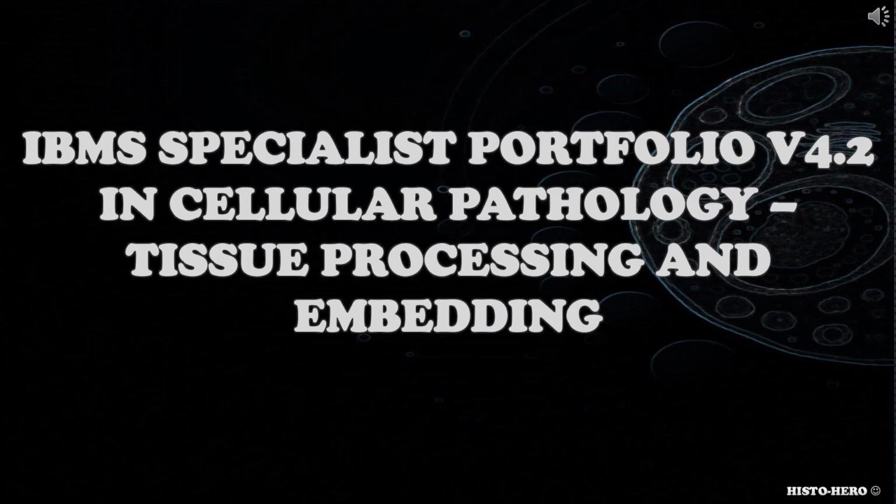And today's video will be about tissue processing and embedding, which is part of the IBMS specialist portfolio in cellular pathology.